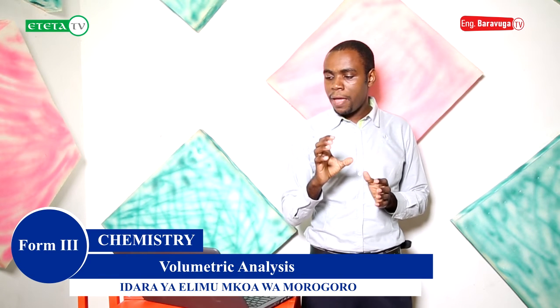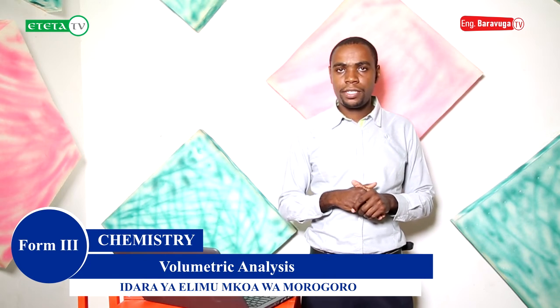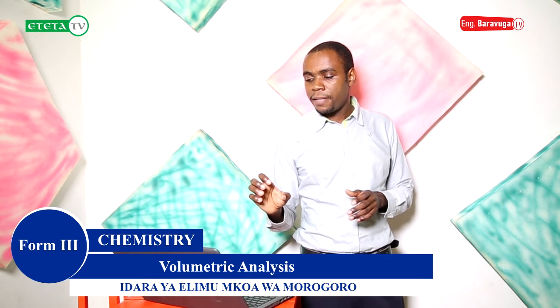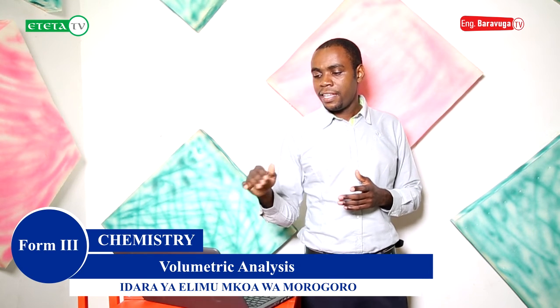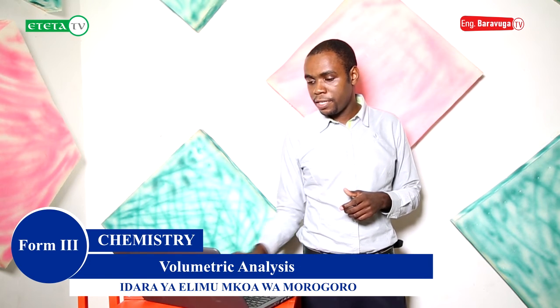The first one is the pipette, and the function of the pipette is to measure the exact volume of liquid. The second apparatus is the burette, and the function of the burette is to measure the accurate volume of liquid. So pipette and burette are both used to measure volume, but the pipette is used to measure the exact volume, and the burette is used to measure the accurate volume of liquid.